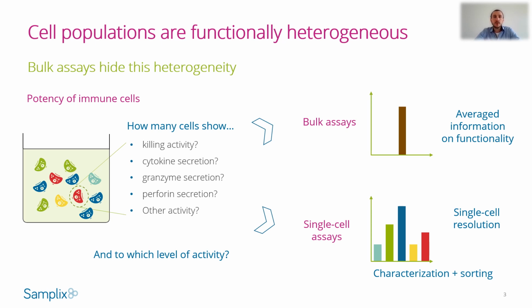The problem with traditional conventional bulk assays is that they really miss the differences between the different cells' functionality within the population of cells examined.